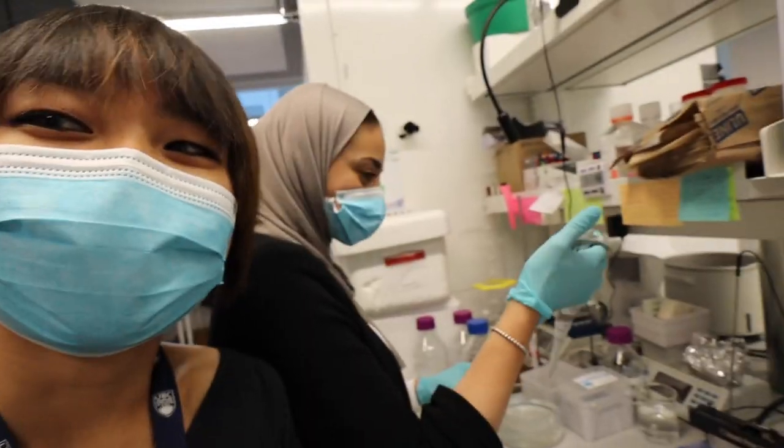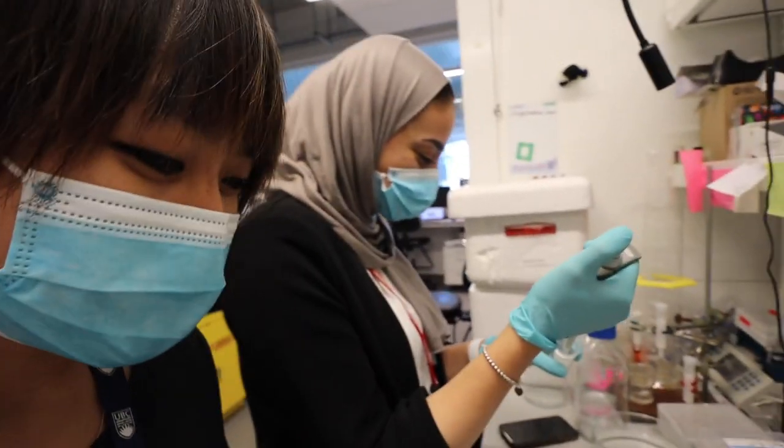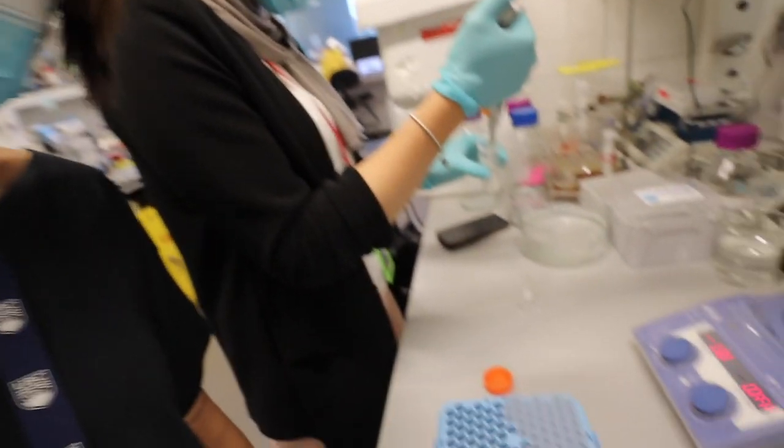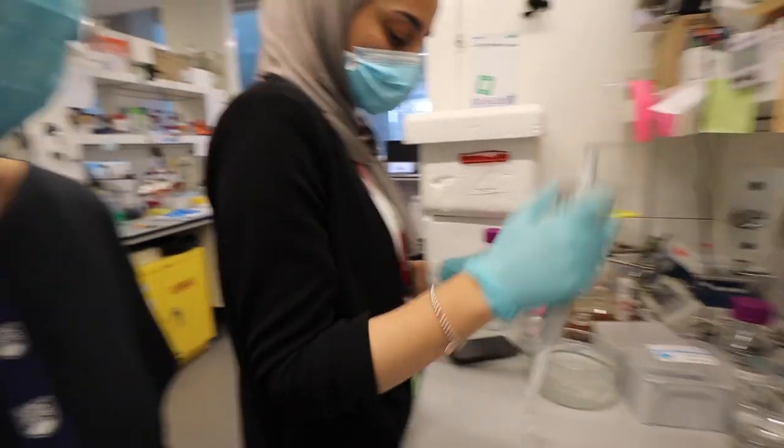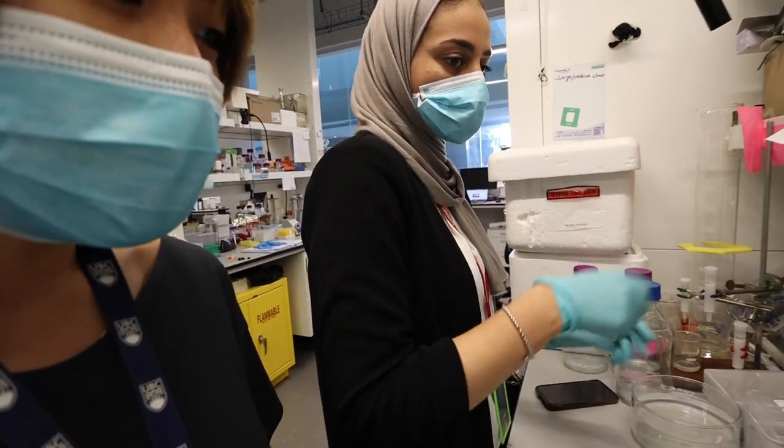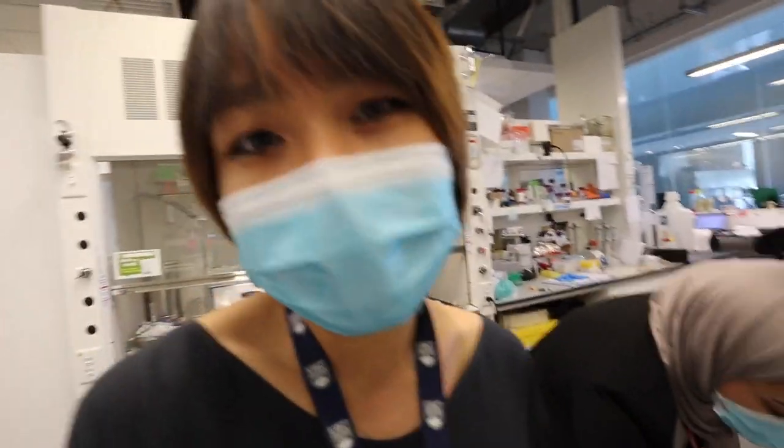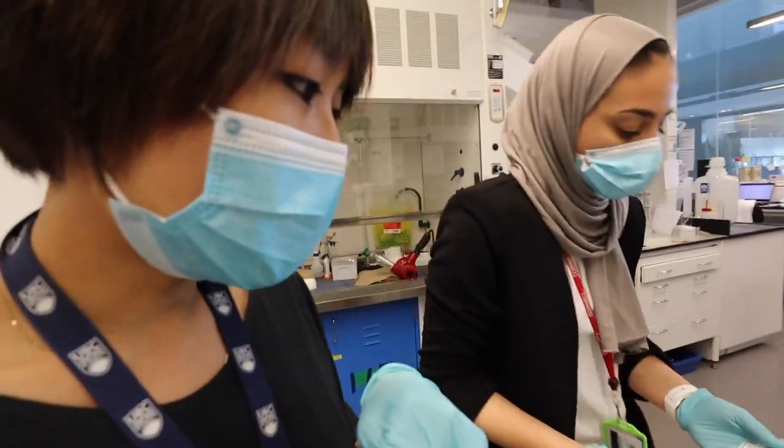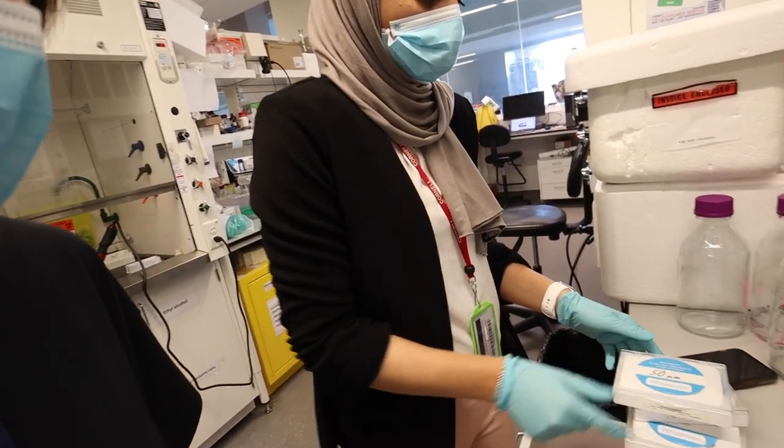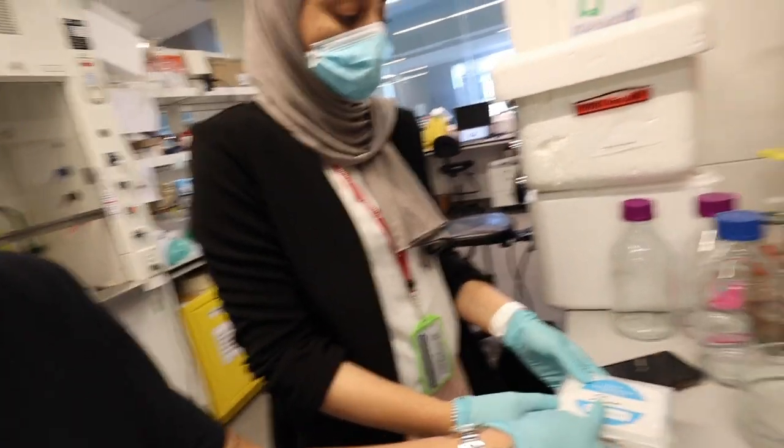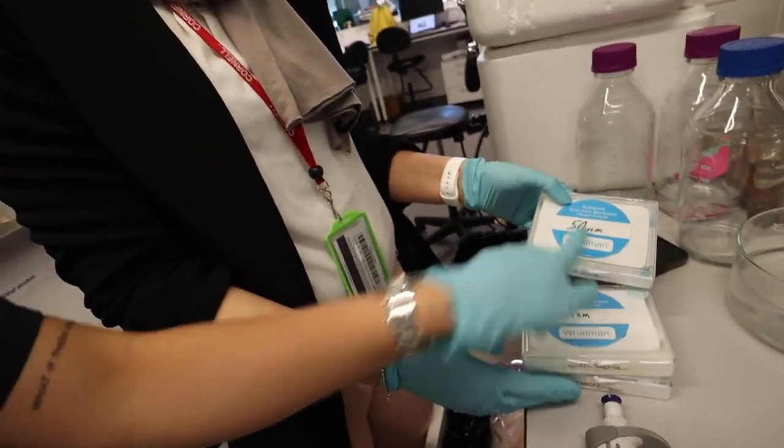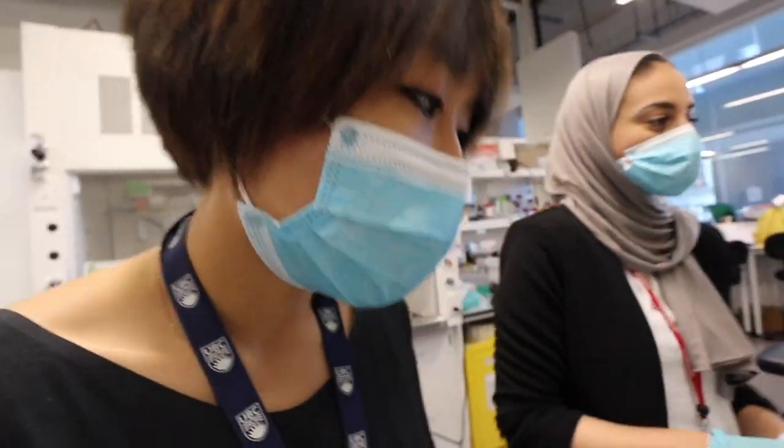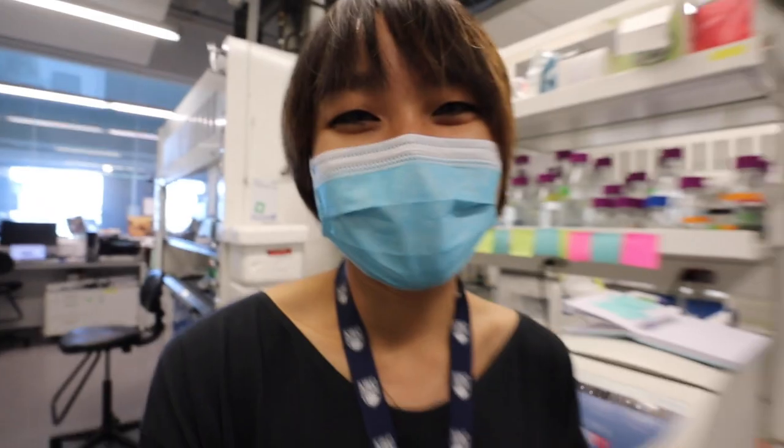We're back from lunch and we are now going to do Noju's favorite thing, which is called extrusion. So first she is hydrating it in the buffer. The process of extrusion is just pushing the lipid mixture through membranes, right? To force it to form nanoparticles. We have to go through three membranes, three different size membranes from biggest to smallest. Right? I'm really afraid because Noju seems to hate this a lot, so I think I would hate it too. But it's okay, we're doing it together.